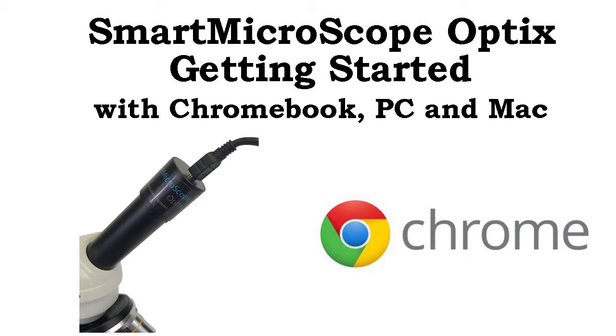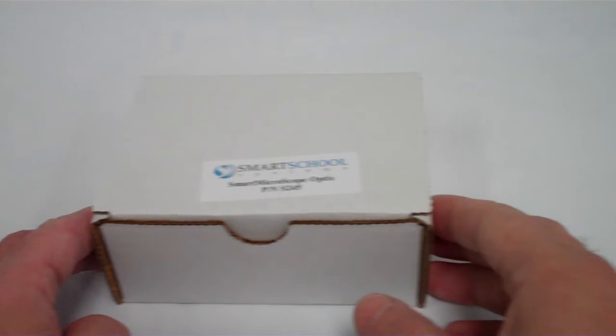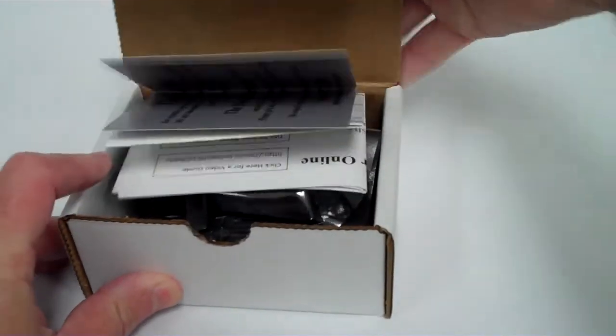SmartMicroScope Optix, getting started with Chromebook, PC, and Mac. We'll start by opening the box and checking out the contents.